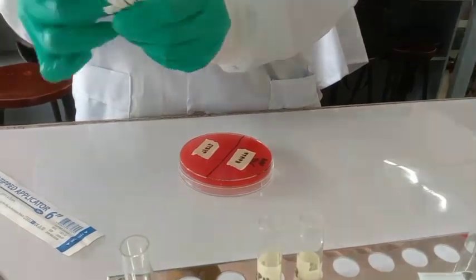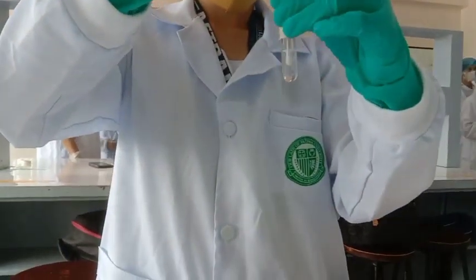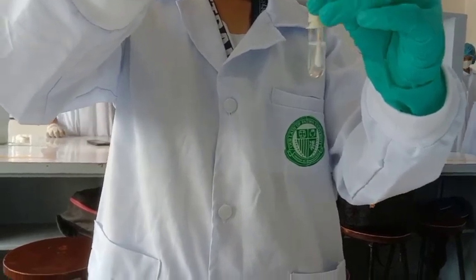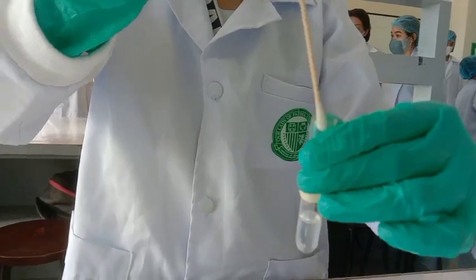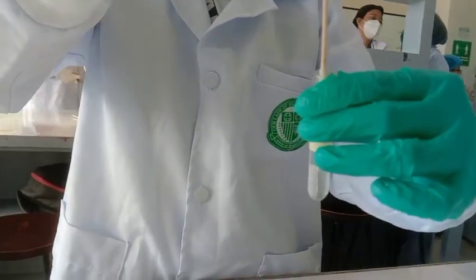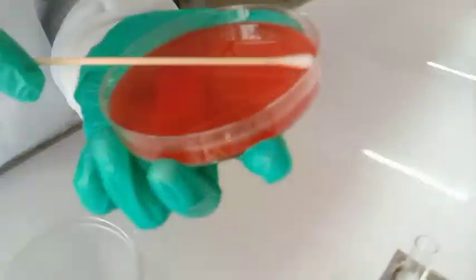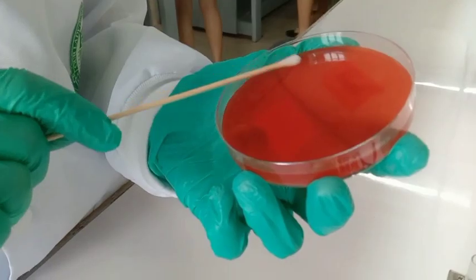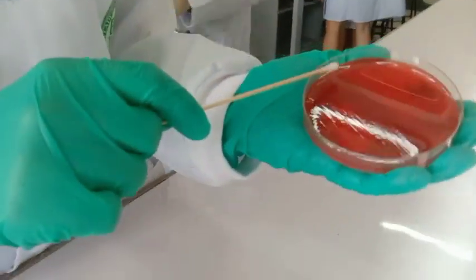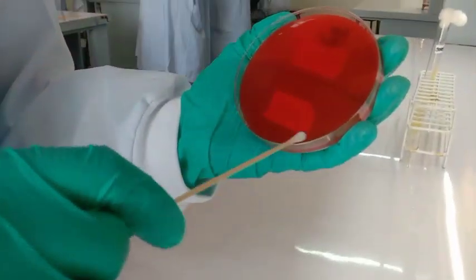Then we will get a cotton swab to get a colony from the broth. Don't forget to tip off the swab on the side of the test tube to avoid excess. Then, using an overlapping streak, inoculate the organism onto half of the blood agar plate.